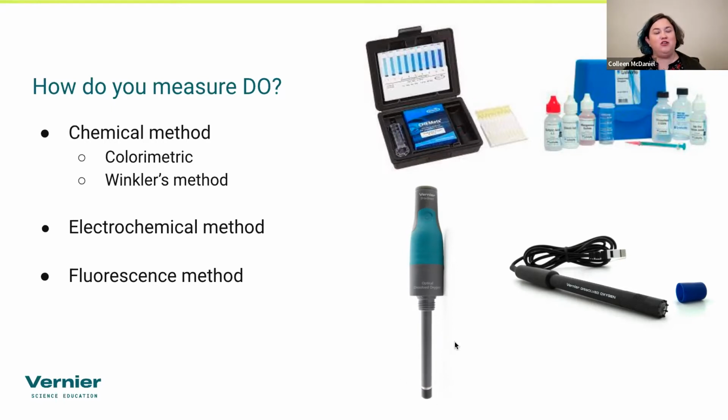So this is the new way that I highly recommend people go towards, because unlike the chemical method, you don't have to use up a water sample. You don't have any chemicals you have to worry about, which you see in the chemical method and in the electrochemical method with the filling solution. And you don't have warm-up or calibration that you necessarily have to do to get it functioning and running. So those are our different technologies and options out there to do dissolved oxygen readings.